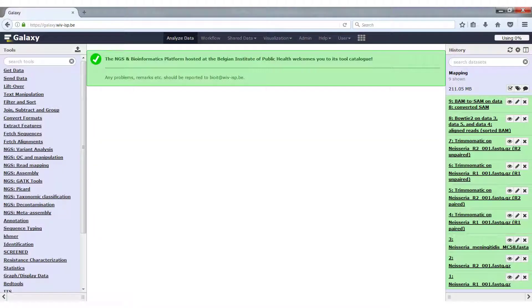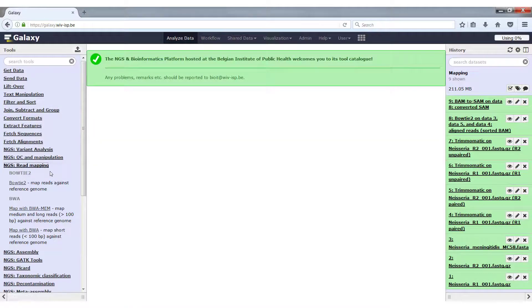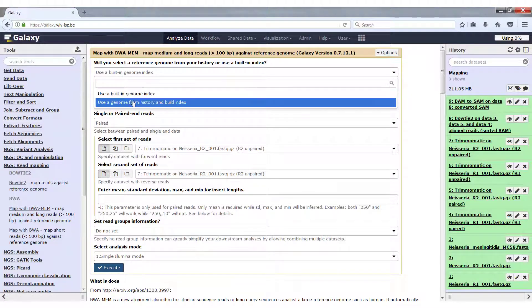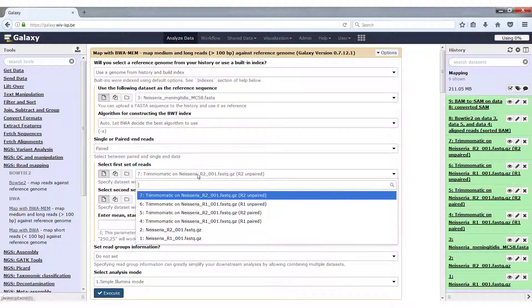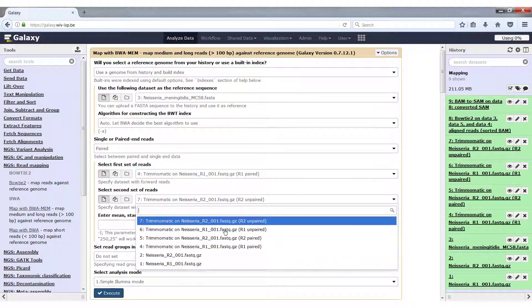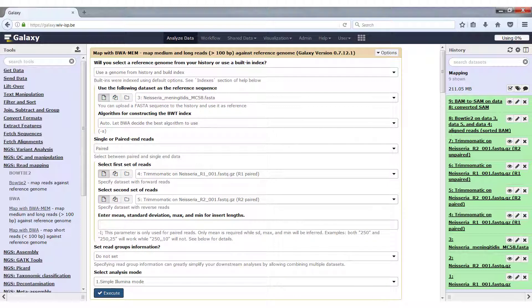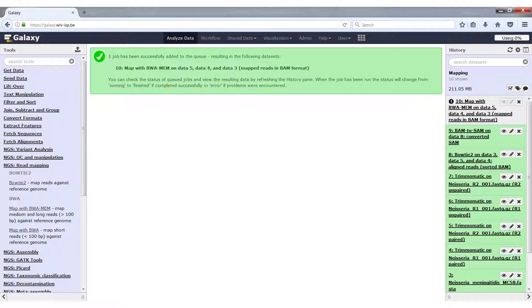Now we go to NGS read mapping and map with BWA-MEM. We use the reference from our history again, and select the R1 paired and the R2 paired input files. Here we can enter the mean, standard deviation, max, and minimum lengths for inserts. If you don't enter a number here, the mean and standard deviation will be estimated by BWA-MEM. If you do have the numbers, you can insert them here. Then click execute and wait for the run to complete.